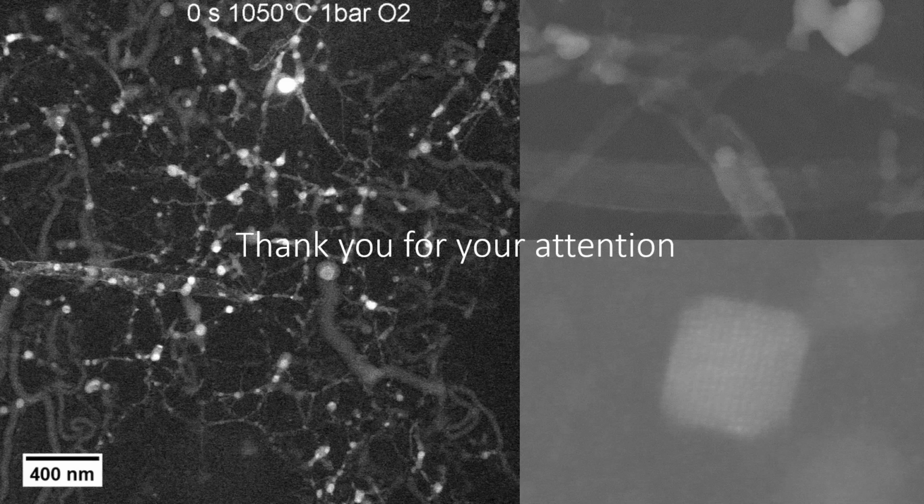So actually, from the gas supply system, of course, I would suggest that as a vacuum system, it's better to pump your vacuum as early as possible. What I mean is, don't wait until before your experiment to start the pump. So this is like your TEM high vacuum experiment. You need to always keep your system at a high vacuum, right? So I would suggest to prepare your system in vacuum condition as early as possible.